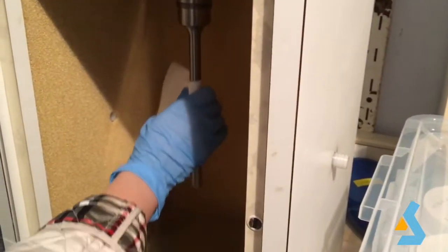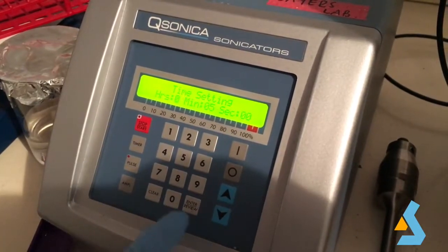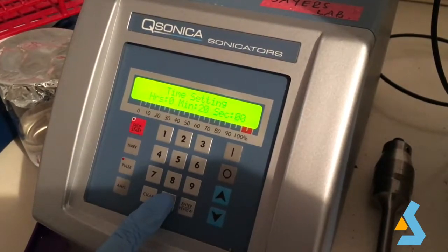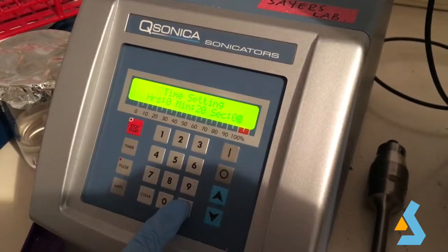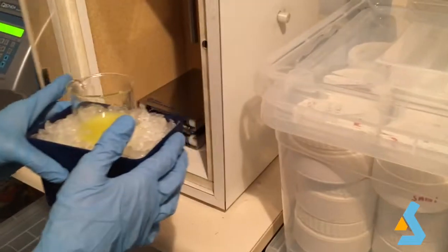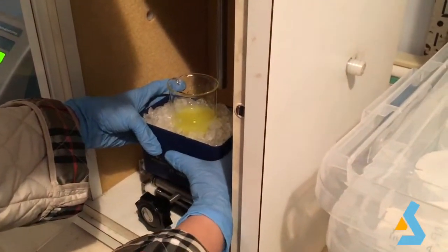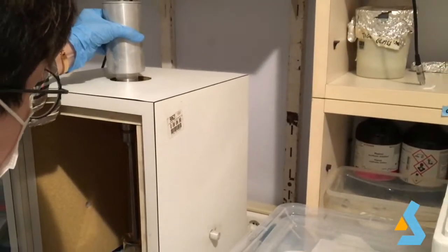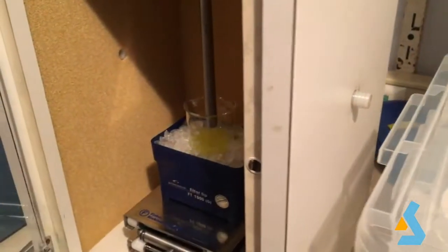First, clean the probe with a tissue and ethanol. Next, set up the parameters for the cell lysis. Here we set a 10 second pulse at 70% amplitude for 20 minutes. After setting the parameters, we place the sample in the probe in a way that prevents contact of the probe with the glass. Then, we press start.